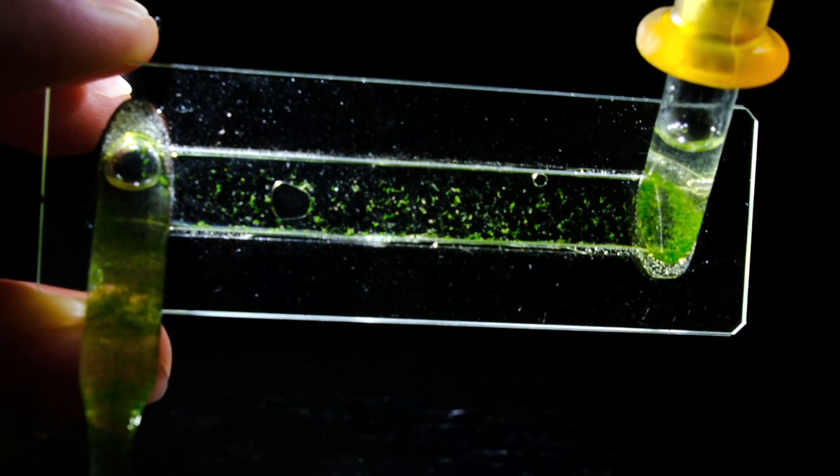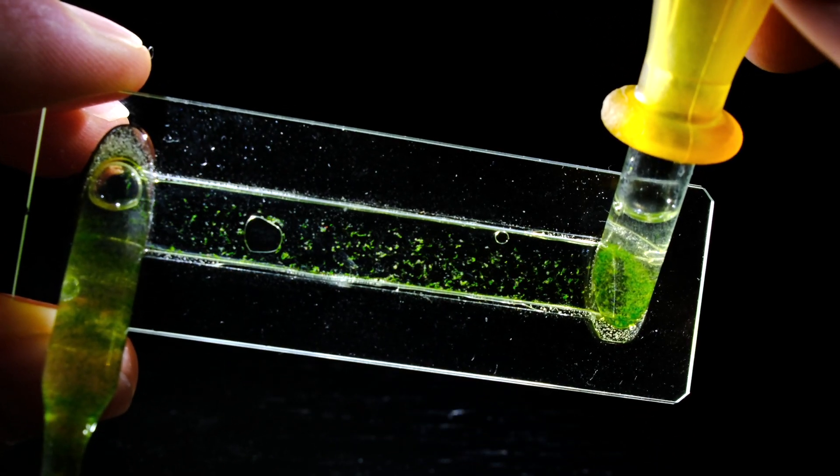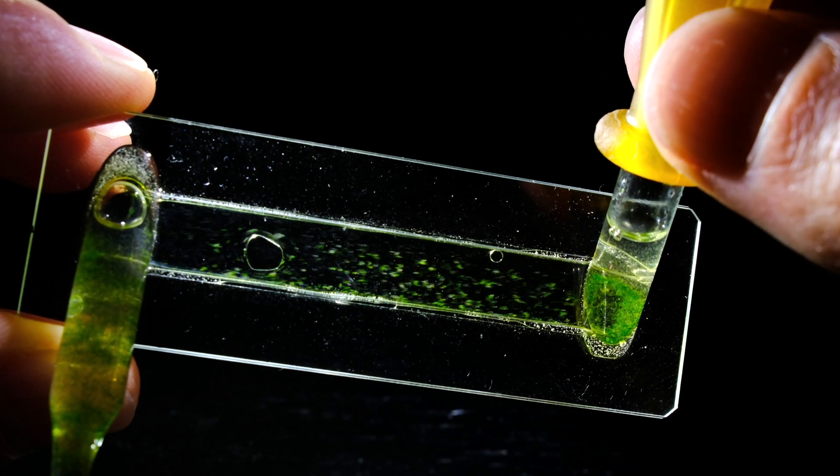When you take up some liquid, it squeezes into a thin film within the internal chamber, which is around one-fourth of a millimeter thin.